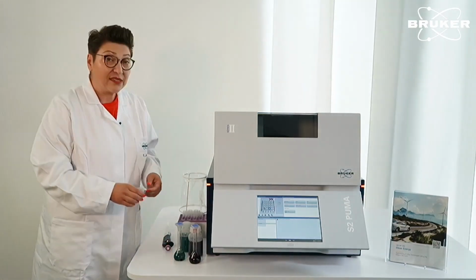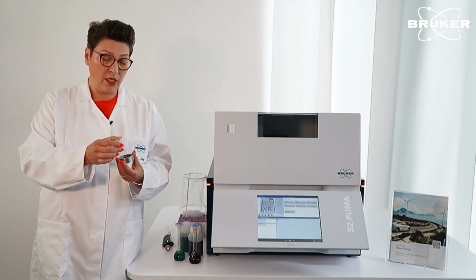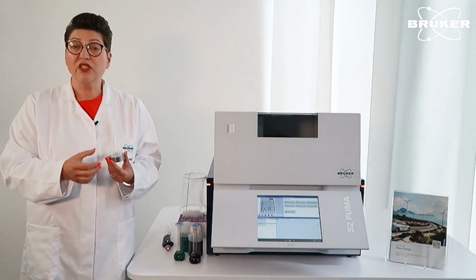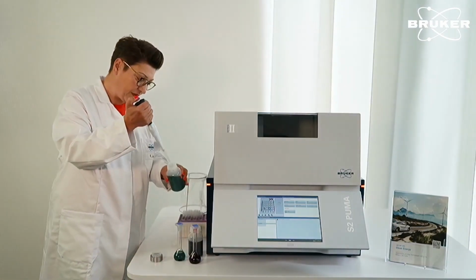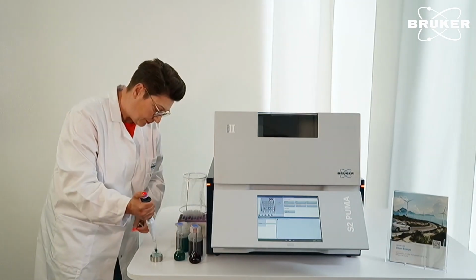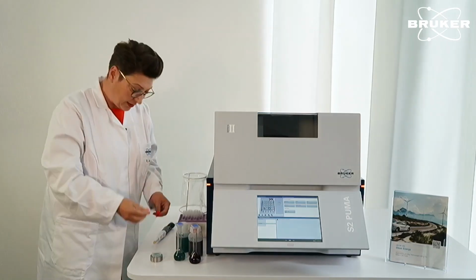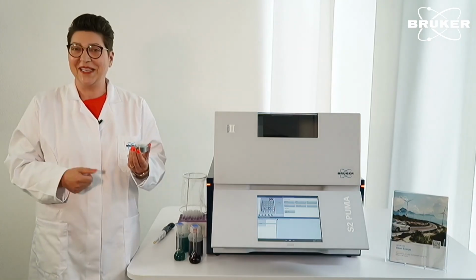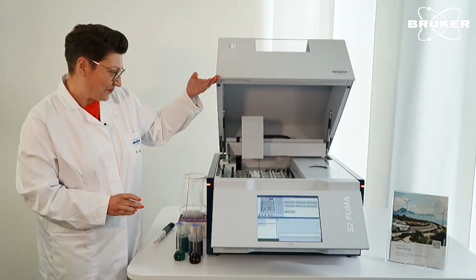So for powder samples or liquid samples, typically we use these liquid caps. They can be prepared by your own, or you can buy them ready to use. You just transfer the sample material into the cap. So I will do so. There is a lid, close the sample, and the sample is already ready to be analyzed. So let's have a look into the system.